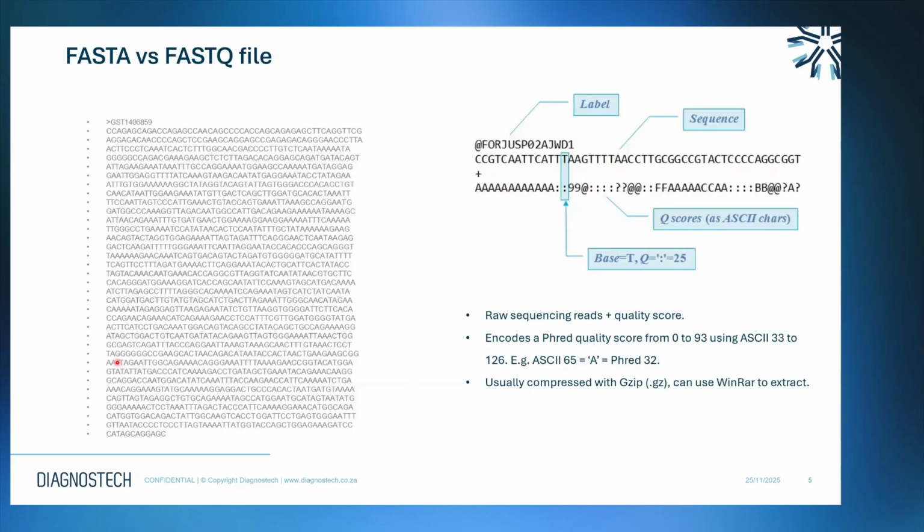So to start off, I just want to cover some of the basic file types and nomenclature that we deal with when we're looking at NGS data. I'm sure many of you are aware of FASTA and FASTQ files, but just to show you what the difference is between those. A FASTA file is something you would get off doing a Sanger sequencing workflow, or many genes are also coded into FASTA files. Generally, you'll have a header, which will give the organism or the gene name, and then just a continuous stretch of nucleotides, which really shows what nucleotides are contained within that gene.